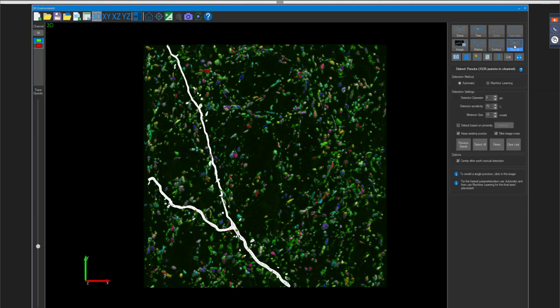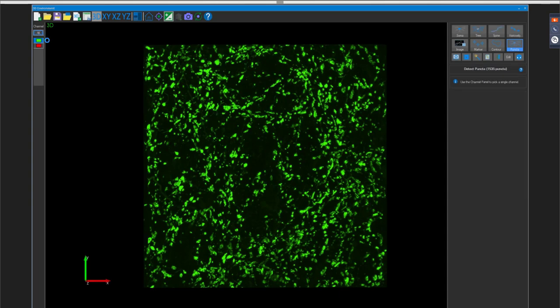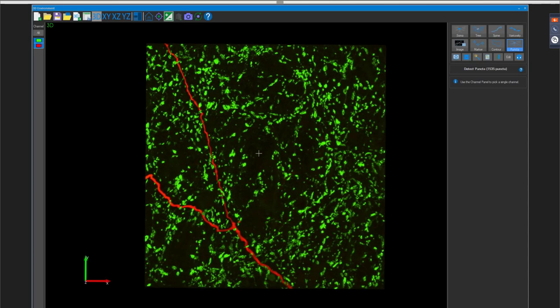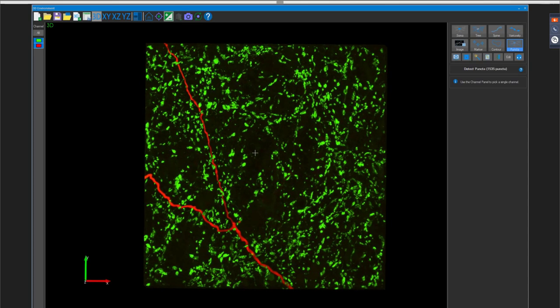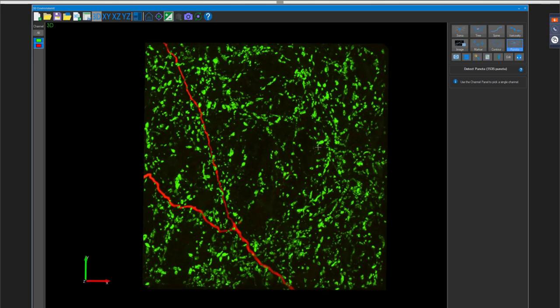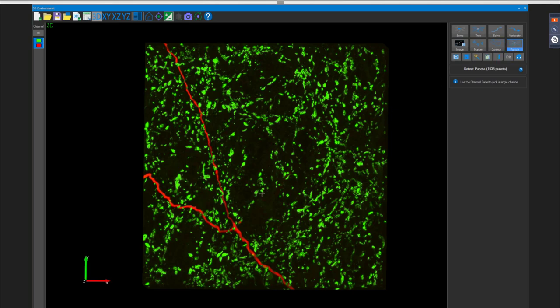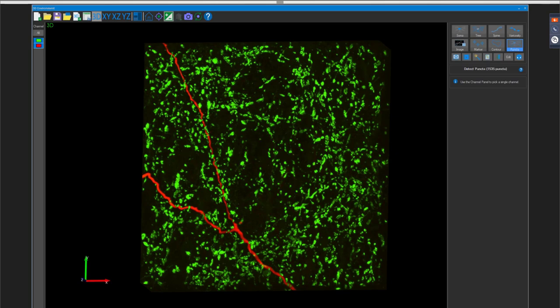On the automatic side there's also machine learning implemented in the puncta detector. Switching to a different, more complex image — provided by Sarah Stanley, showing dorsal root ganglia with cleared tissue labeled with red and green channels — better highlights the benefit of machine learning over the clean demo image.